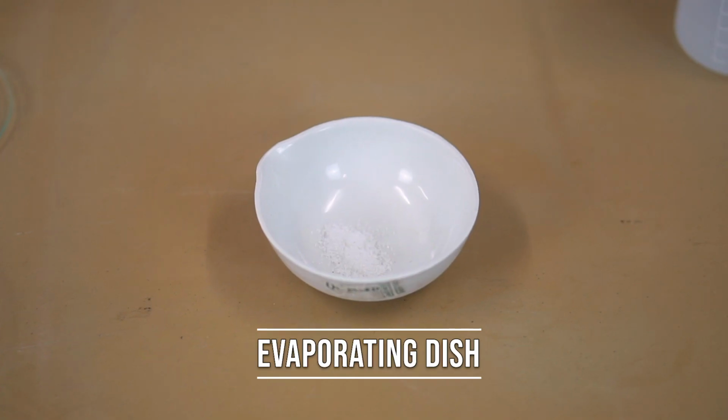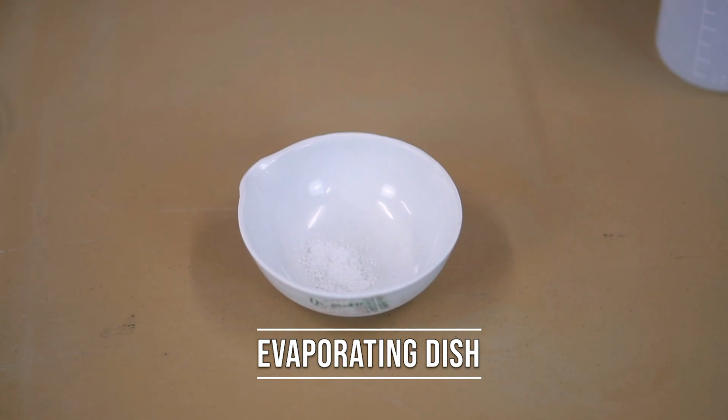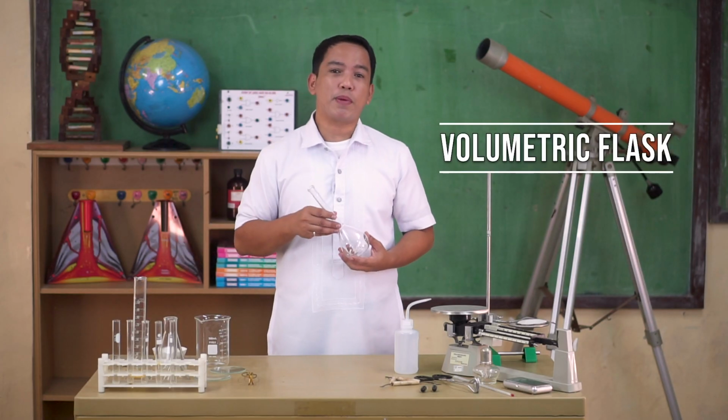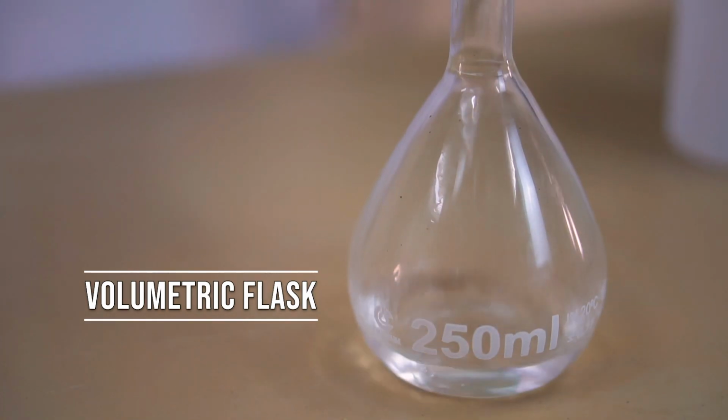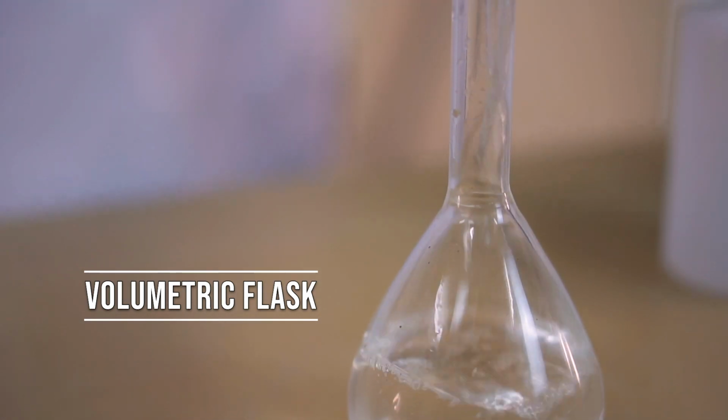Evaporating dish is used for evaporation of solutions and supernatant solutions to produce a concentrated solution or a solid precipitate. Volumetric flasks are used to measure precise volumes of liquid or to make precise dilutions.